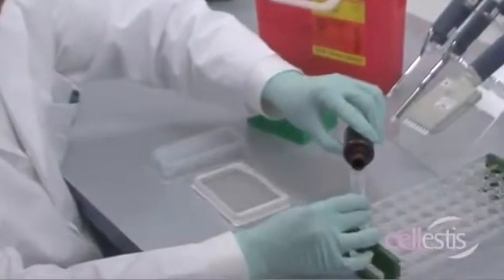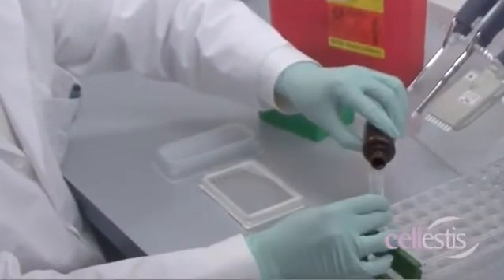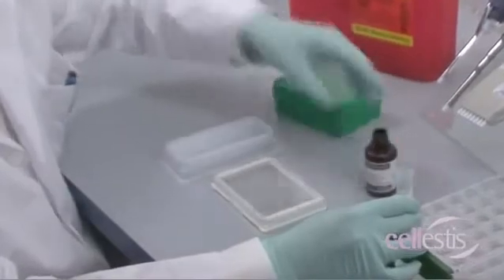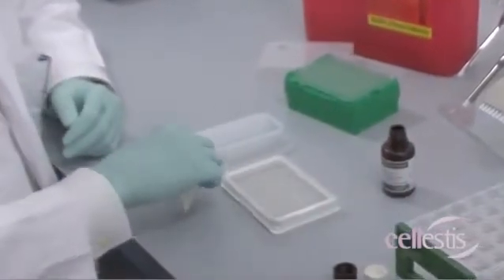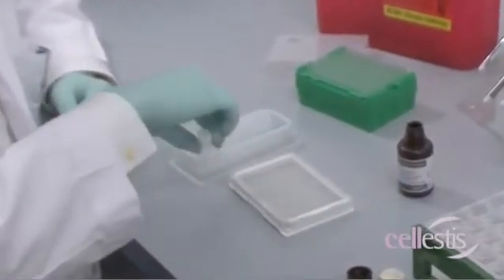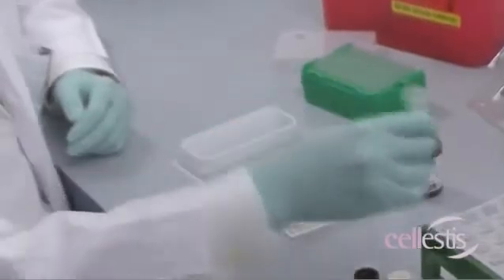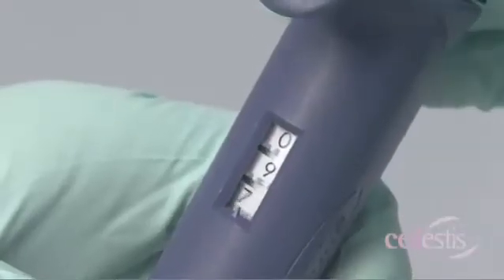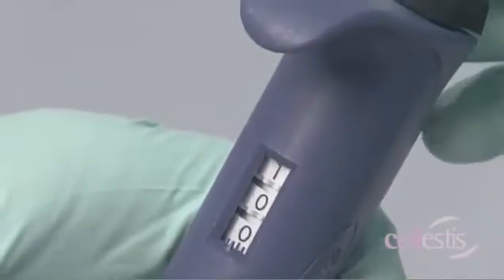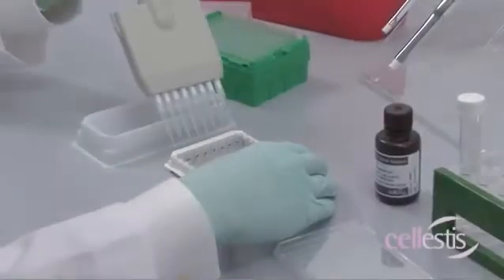Pour enzyme substrate solution in a clean reagent reservoir. Add 100 microliters of enzyme substrate solution to each well.